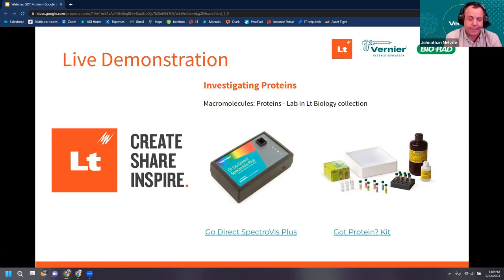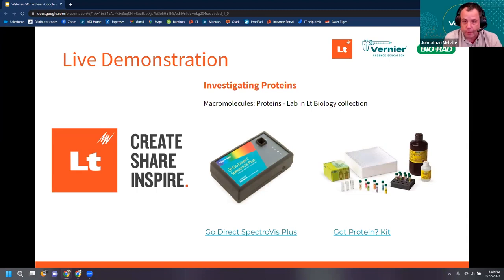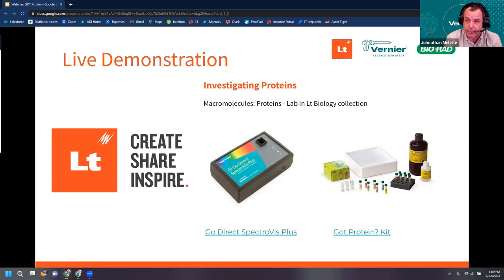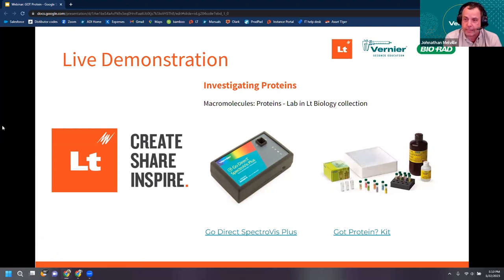What we're going to be doing is talking about a lab activity that is in LT. To do this lab you will need a Go Direct SpectroVis Plus — that is our spectrometer, our small affordable spectrometer — and you also need the Got Protein Kit, which is a kit from Bio-Rad. I want to stress that you do data collection directly in LT; I'll show you how to do that. There is also sample data you can access, but we'll focus on showing you how to use the spectrometer in LT.